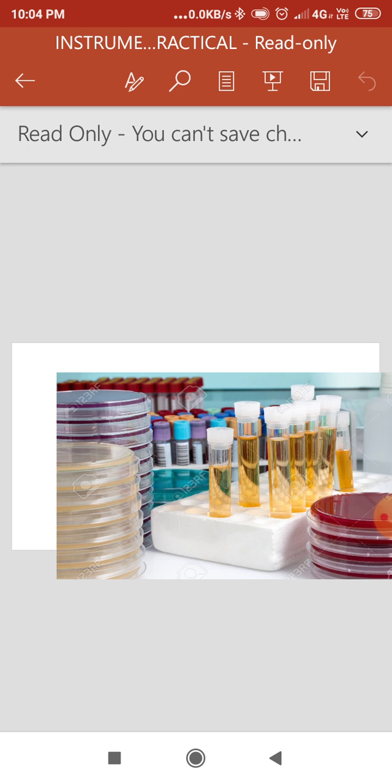Don't eat anything within the lab, or drink water also in the lab, because as we know the organisms are omnipresent, so they are present everywhere. We are working with organisms, so E. coli is there, Staphylococcus aureus is there, and again there is the presence of fungi. If the fungal culture is there, it spreads widely. So these contaminations can enter through food or water into your stomach or body, so it is hazardous to us. So don't eat or drink anything in the microbiology lab.